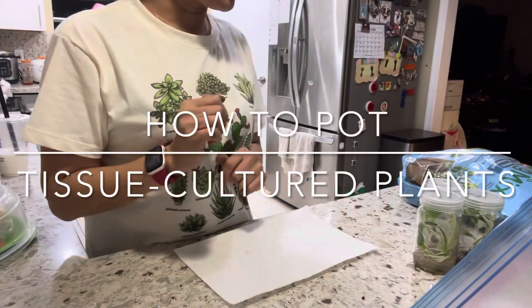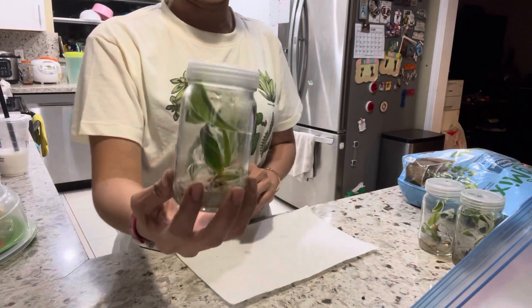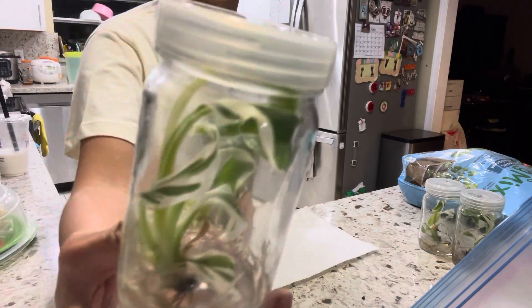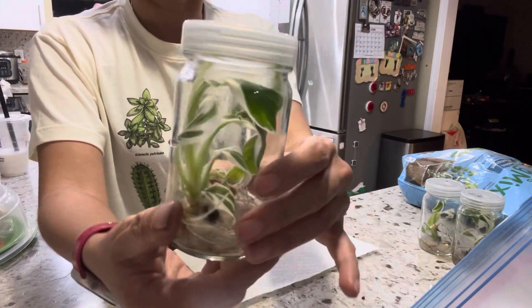Hi everyone, I'm going to show you how to deflask the tissue culture and how to pot the tissue culture. This one is a variegated banana — it's a Florida Musa — so it comes in a flask or a jar.